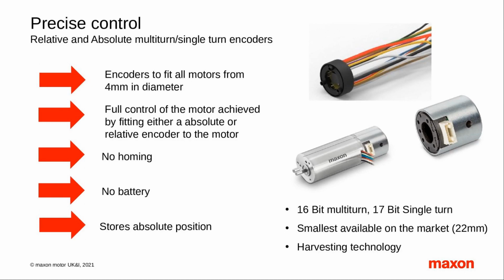The resolution of the encoder is important. The higher the resolution, the more pieces of information the drive system has to tell it where the rotor is, the motor rotor, which for some applications is vital. So it's by using encoders that enables you to precisely control the lab automation process, or an individual axis.